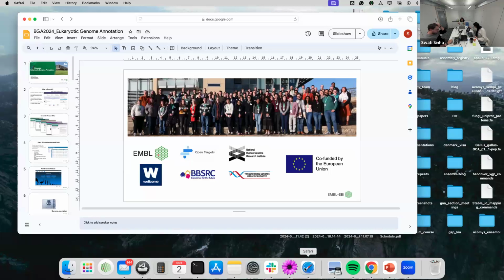If the coverage is good and the identity is high, we can say that it has a one-to-one relationship. But obviously, I can go back and add more to that.